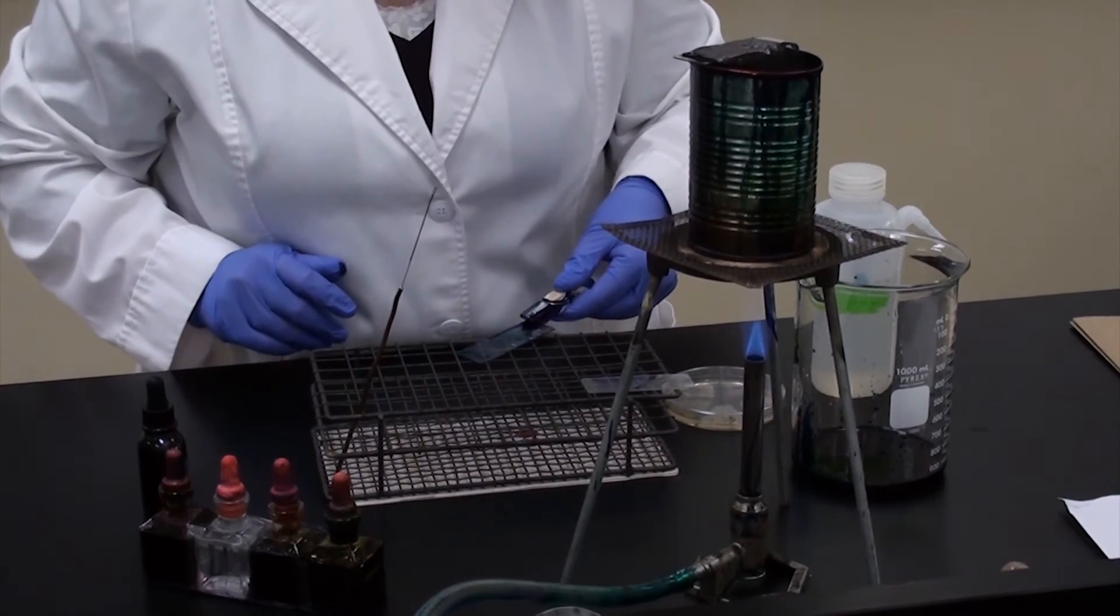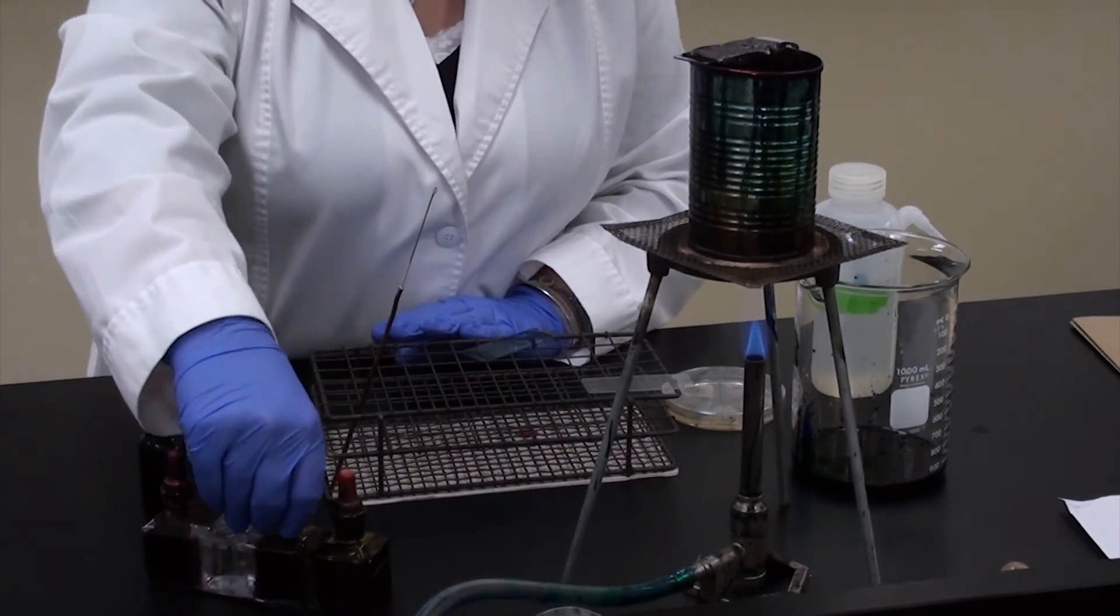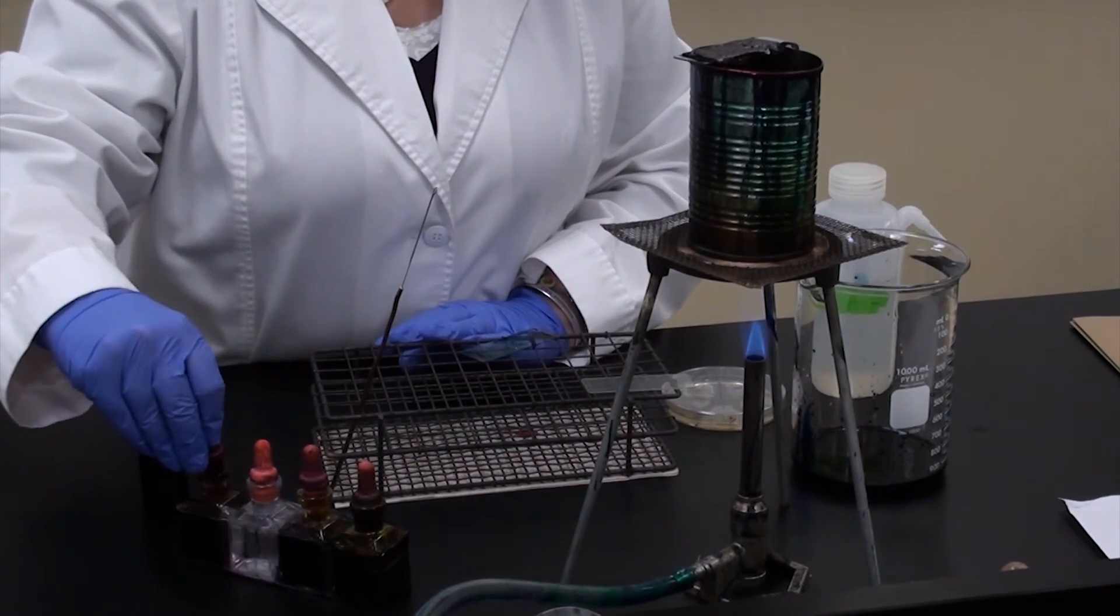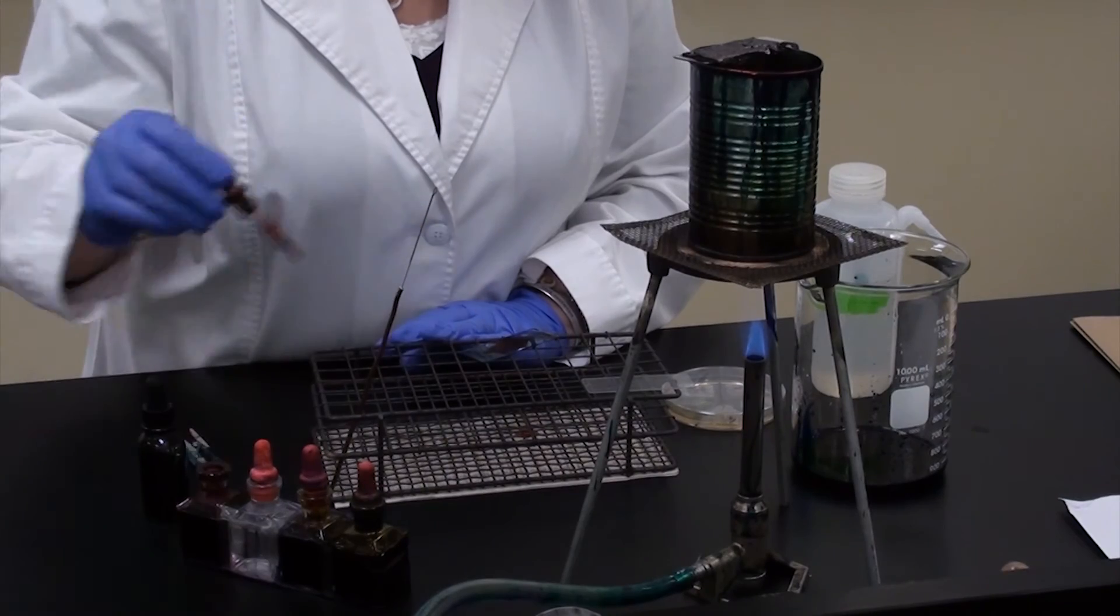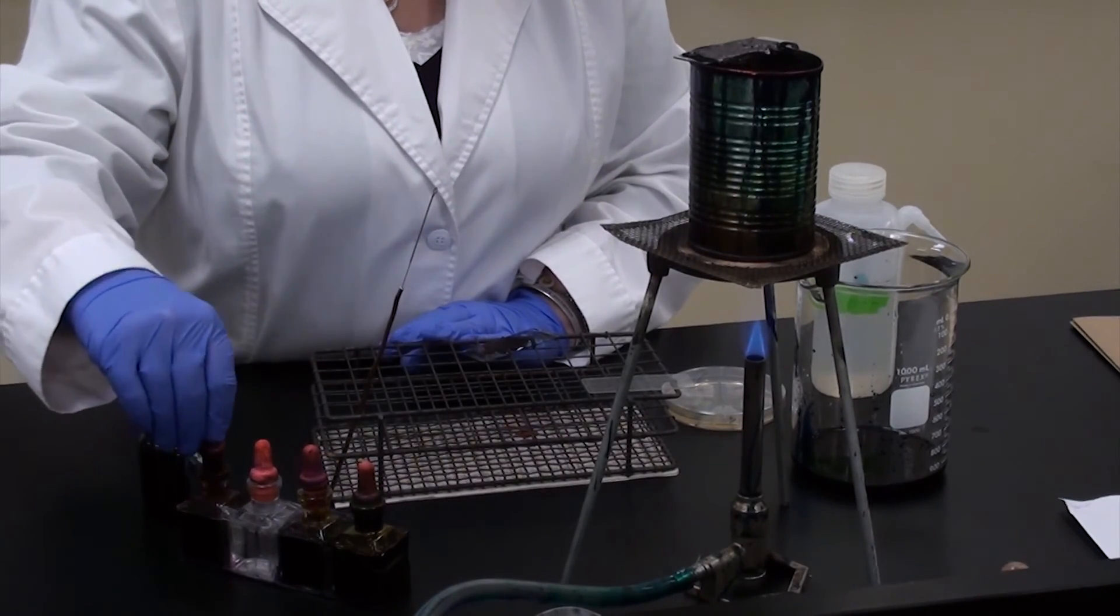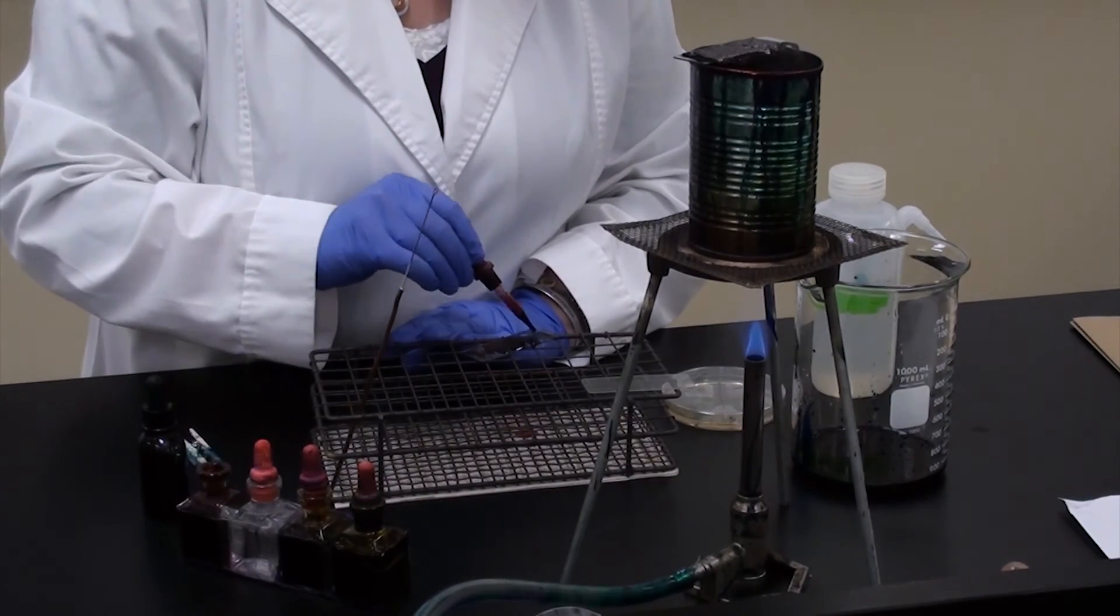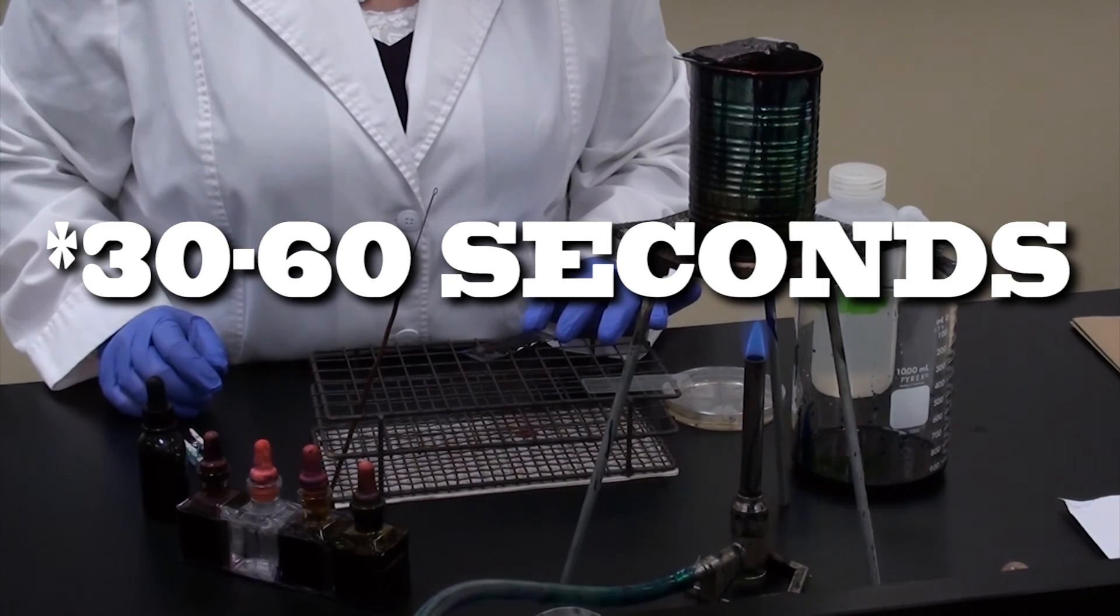Once the slide is thoroughly rinsed, you're going to apply a counter stain. The counter stain is a positive stain or a simple stain. In this case, I'm going to use safranin that will stain the vegetative cells remaining in the sample. Just as before, flood your slide, nice and moist, and let it sit for 30 to 60 seconds to stain the vegetative bacteria.